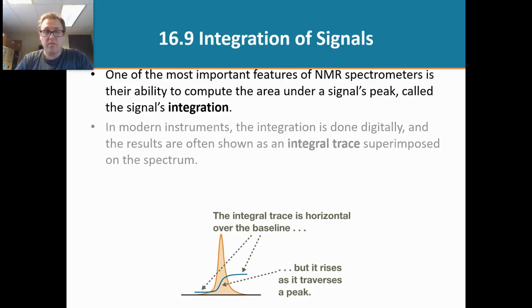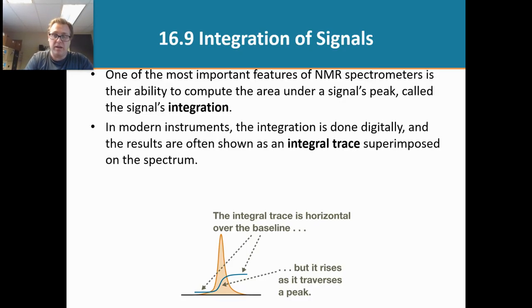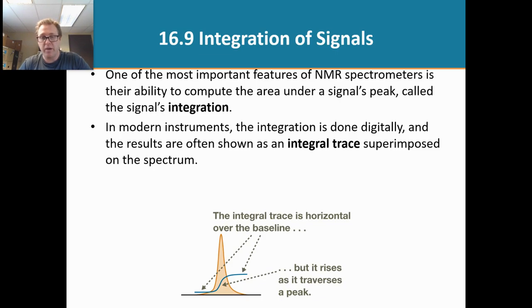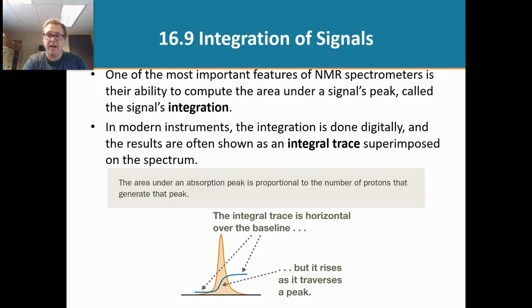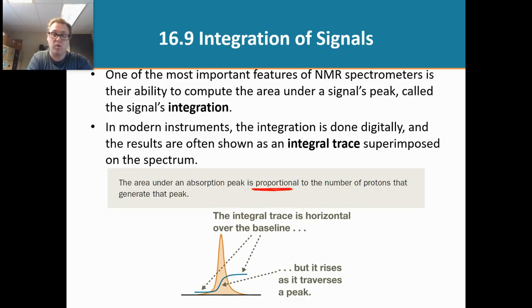What the machine does is it puts an integral trace, shown in blue right there. That integral trace is going to help us figure out the area under the curve. Why do we care about calculating the area under the curve? The area under the absorption peak is going to be proportional to the number of protons that generate the peak.